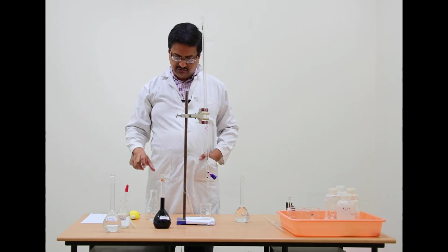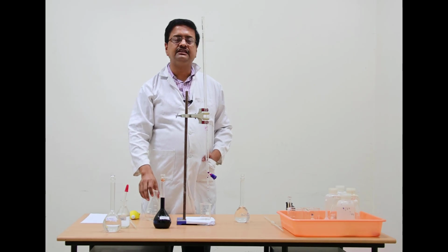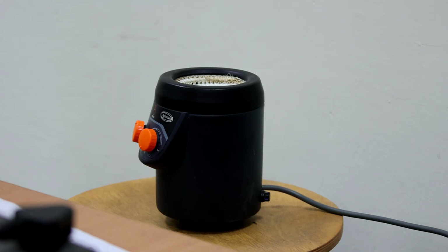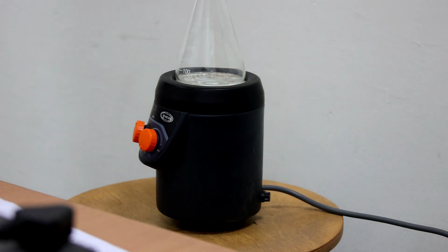So let us go and start heating this solution to about 70 to 80 degrees centigrade using the heating mantle. This is the heating mantle on which we are going to heat this mixture of oxalic acid and sulfuric acid. We should heat it only up to about 70 to 80 degrees centigrade, and we should not boil the mixture, because on boiling, oxalic acid will decompose and produce carbon dioxide. So we should make sure that we only heat it to about 70 to 80 degrees centigrade.